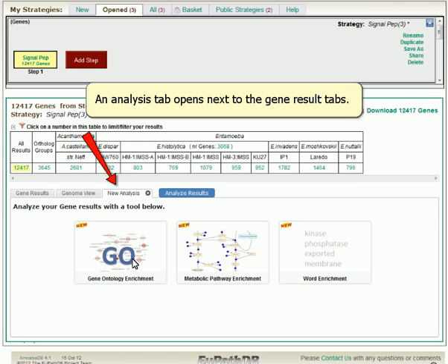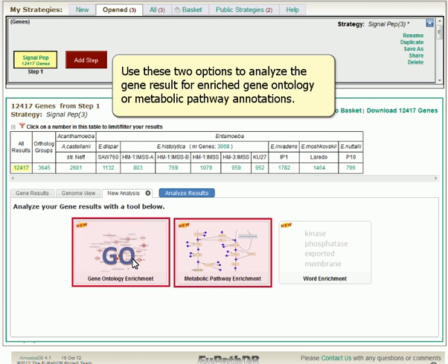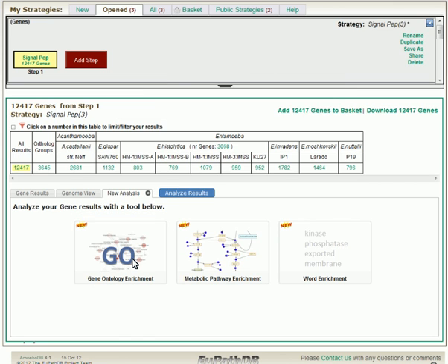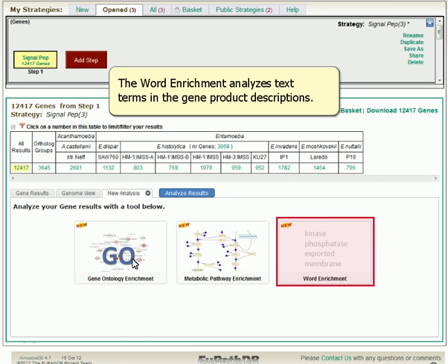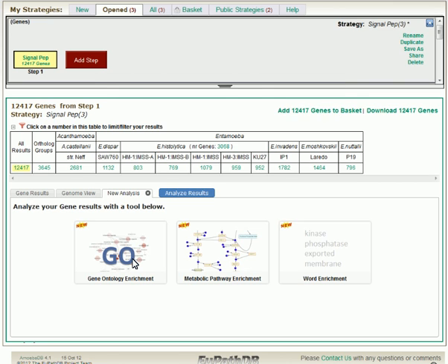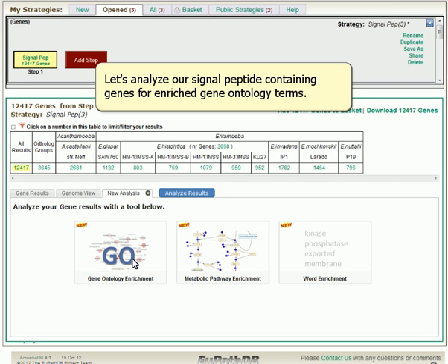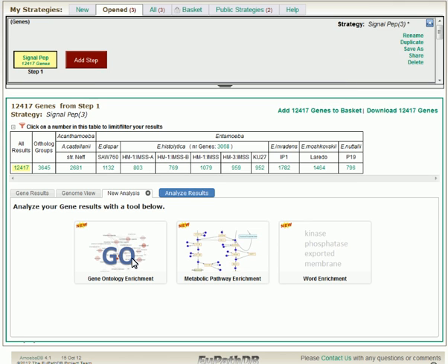An Analysis tab opens next to the Gene Result tabs. Use these two options to analyze the gene result for enriched GO ontology or metabolic pathway annotations. The word enrichment analyzes text terms in the gene product descriptions. Let's analyze our signal peptide-containing genes for enriched gene ontology terms.